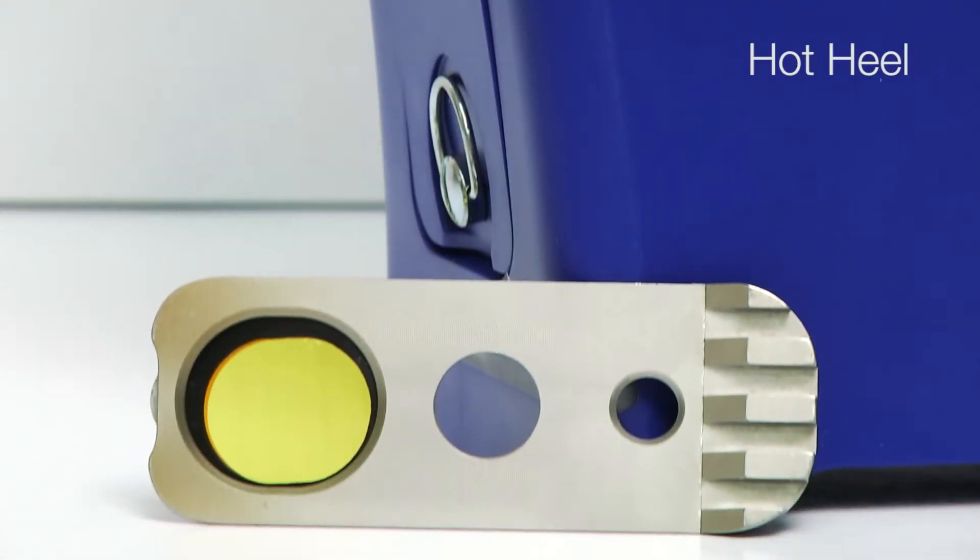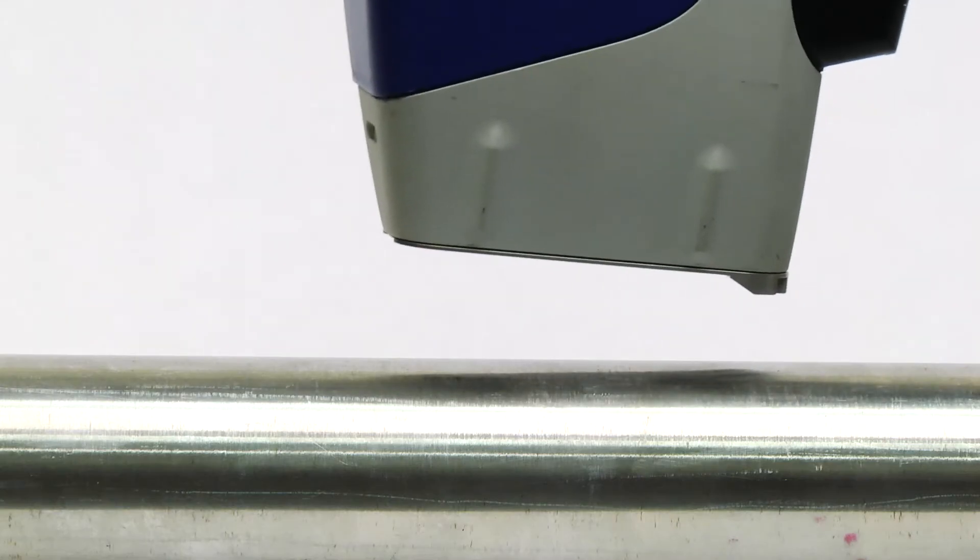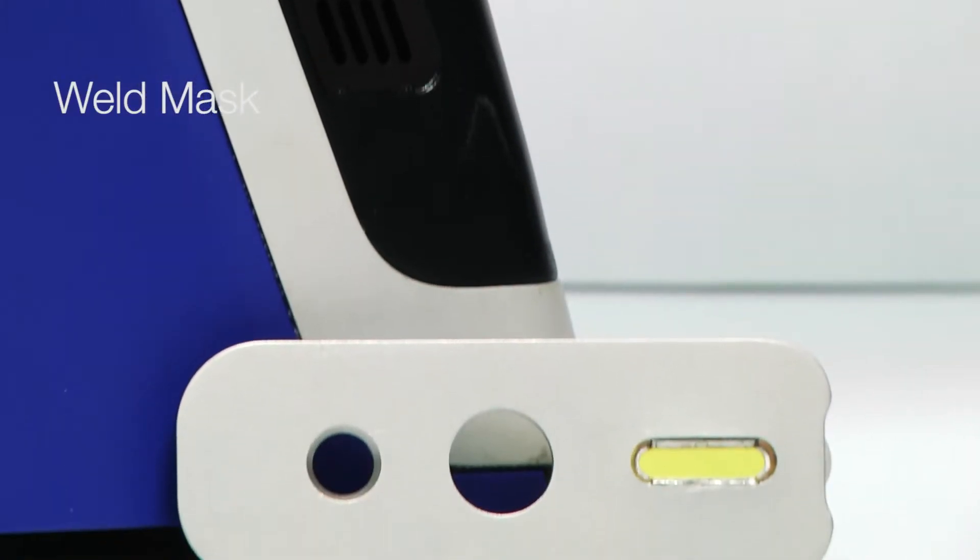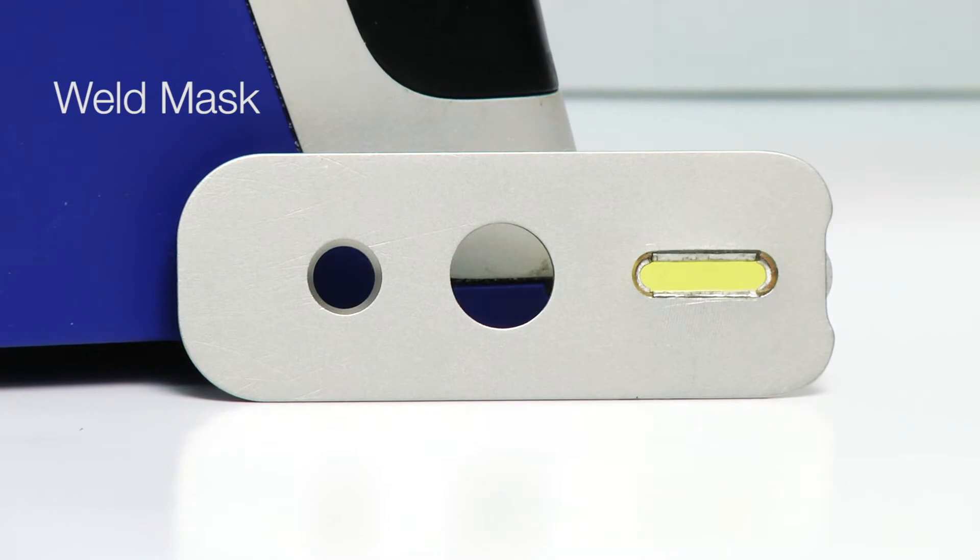The hot heel is used to maintain a gap between the window and sample to minimize heat transfer when testing hot objects. And the weld mask is used to focus on a narrow strip of material, like a weld.